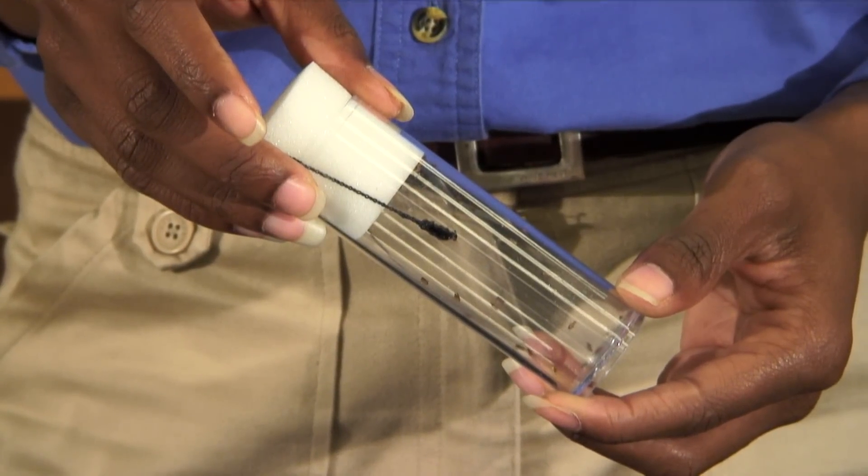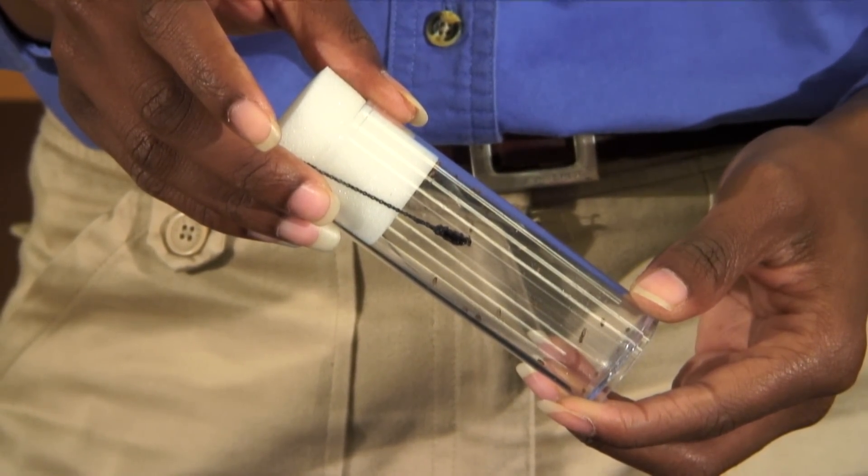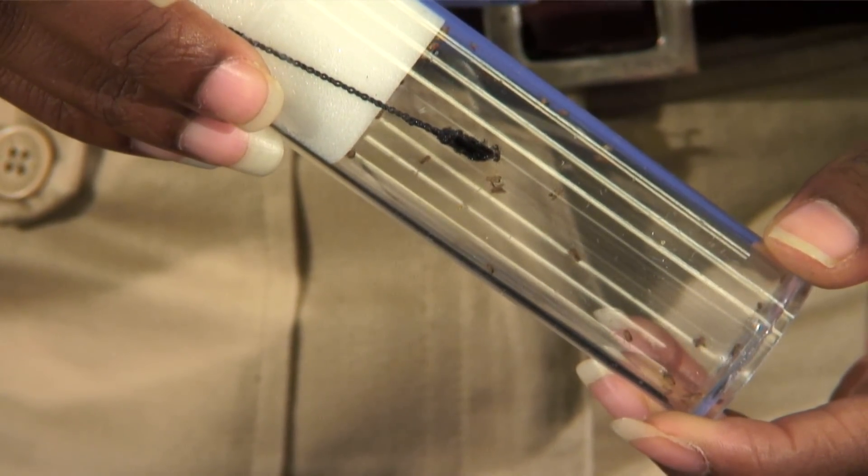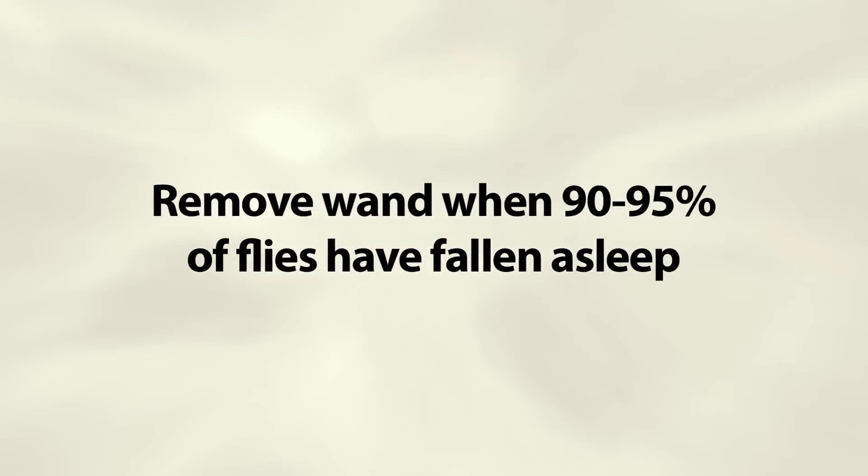Position it beside the plug so that the anesthetic tip is below the plug. Keep the culture vial upright with the wand in place. Watch the flies closely and remove the wand when 90 to 95 percent of the flies have fallen asleep.